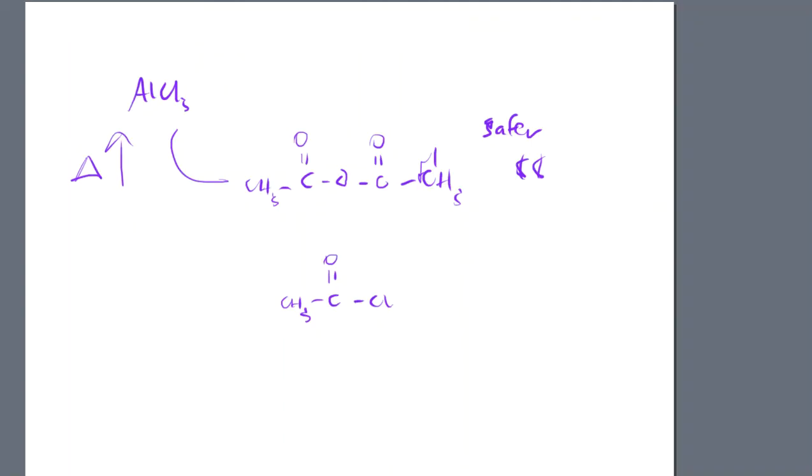All right, so the next step, like I said, is fairly strange, and some people do have questions on why we do it the way that we do it. Keep in mind that this reaction is using excess aluminum chloride, AlCl3. There's a lot of this that's going to be left over that has not reacted and hasn't really done anything, but we don't want this to interfere after the last step of the reaction takes place.